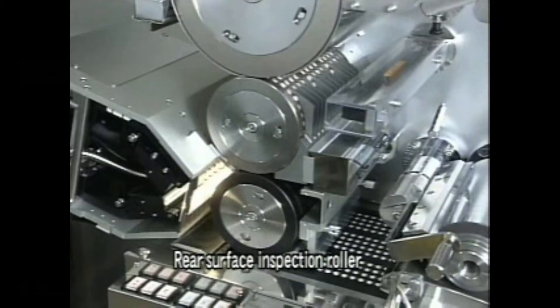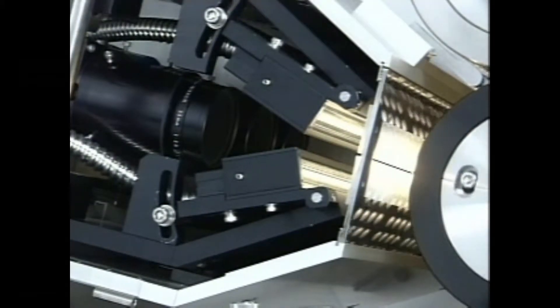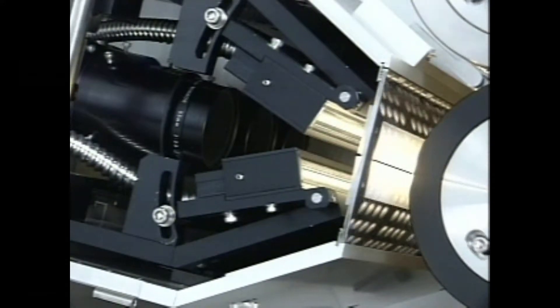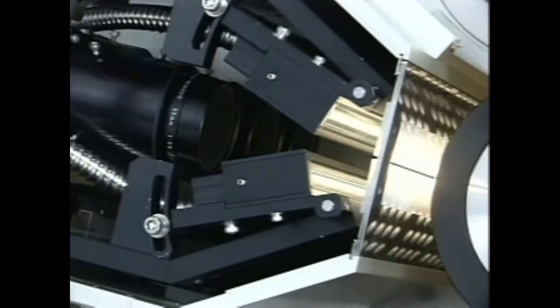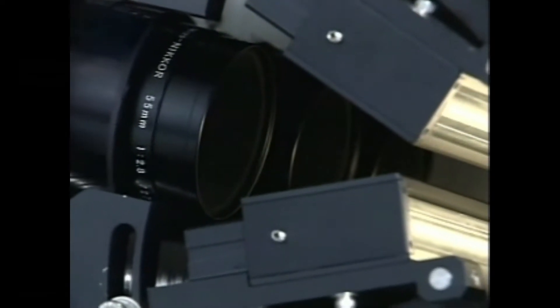The tablets are suctioned onto the rear surface inspection roller, and then the rear surface is checked using the 2048 Elements CCD line sensor camera. Direct viewing with the camera allows us to perform perfect inspection without any influence from prisms.